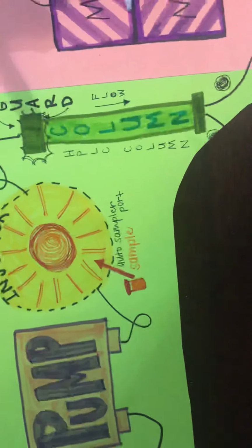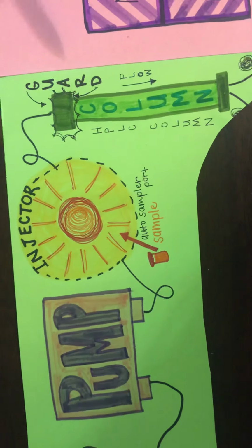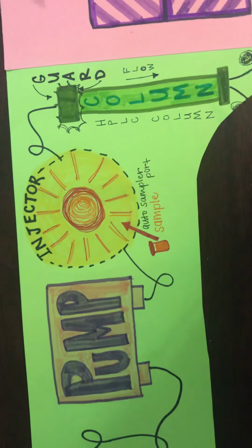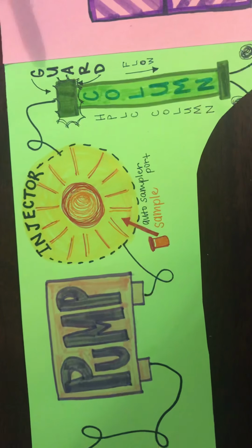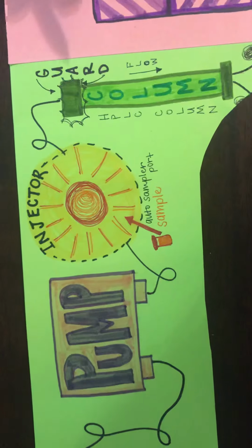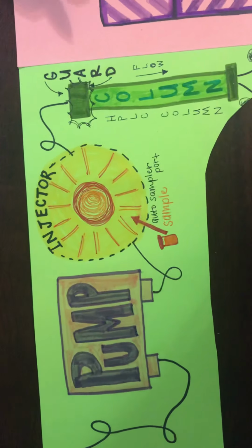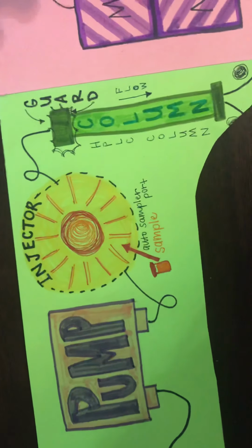And so if we are wanting to change the polarity of our column because of our analyte, we can use different beads that obtain different compounds attached to them, such as a completely new substituent, or we can manipulate the length of the carbon chain by shortening it or elongating it.